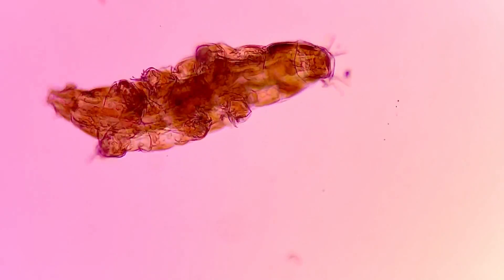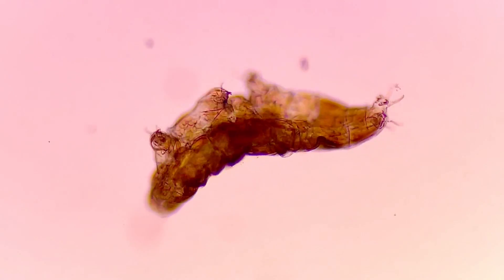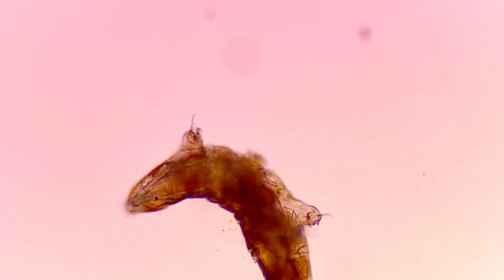This is a water bear, and today I'm going to show you how to catch one. There are many ways to find a water bear, but I think this technique works the best.